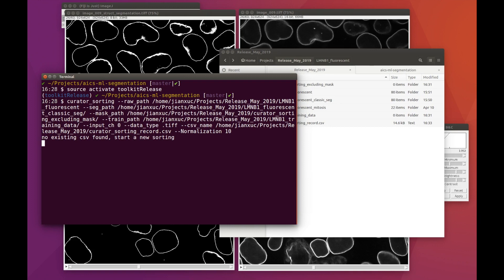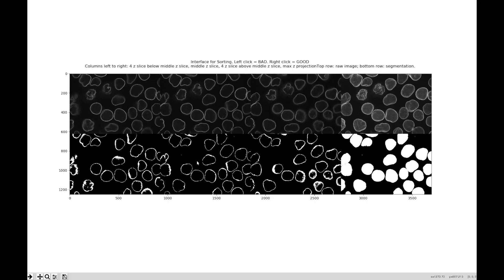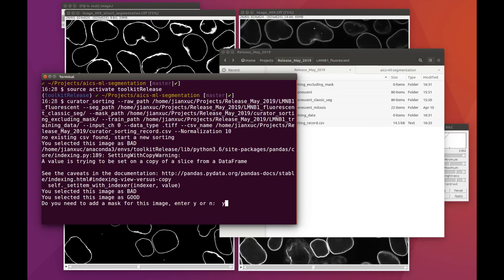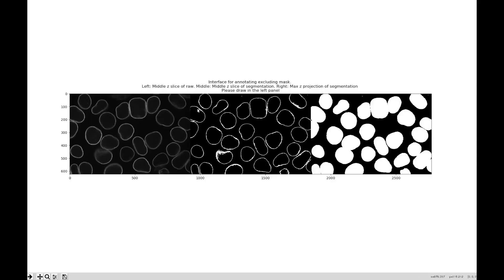Once we've got that command all set up, we can start the sorting curation steps. An interface will pop up which shows you specified slices and a max projection. We're going to use a left click to identify bad images and a right click for good segmentations. In this image, this kind of elongated cell is missing in the segmentation, so we're going to left click and annotate this as a bad image. In contrast, the segmentation of this image looks very good with only one minor issue. So we want to say this segmentation is good, but we're going to exclude this small area in the corner — we'll right click, say that it's good, and when the curator asks if we need an excluding mask, we'll say yes. We'll use a left click to draw our polygon shape in the leftmost image, then right click to close our polygon, and press D when done.